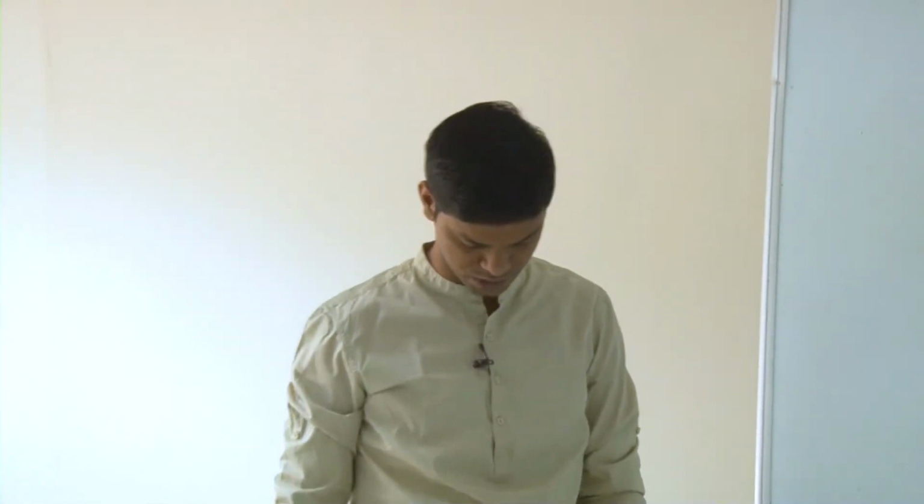Welcome everyone. So, in the previous lecture we discussed the mass spectrometer, the basic principle of it, different components of the instrument, and also we discussed the resolving power, efficiency and abundance sensitivity of a mass spectrometer.